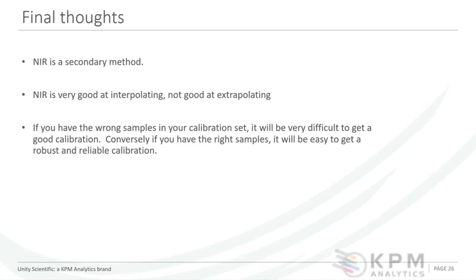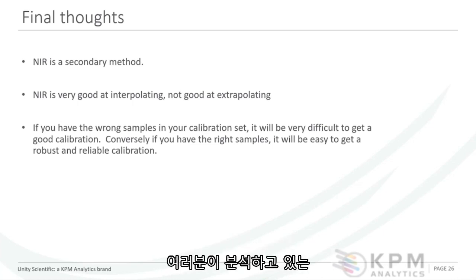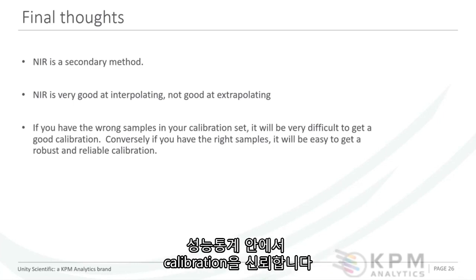Another key part is that near infrared is very good at interpolating, but it's not very good at extrapolating. And this relates to the last point also, but if during your calibration process, you've exposed that calibration process to the sample variation you expect to see, so that your unknowns that you're analyzing afterwards fall within that calibration set, I'm going to trust the NIR calibration within its performance statistics.